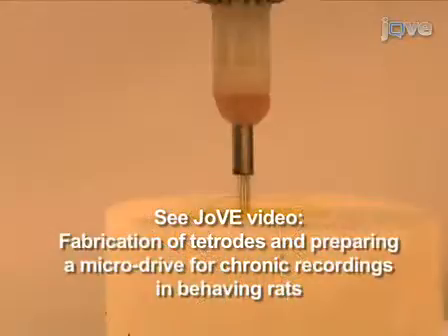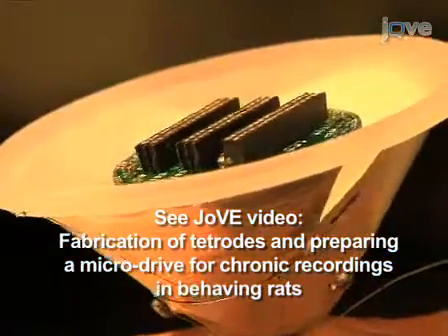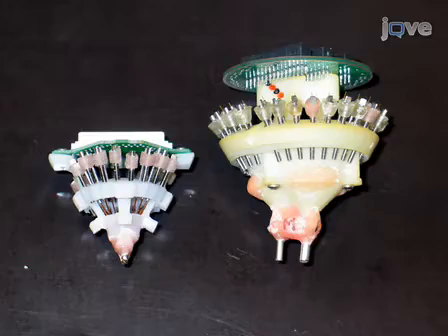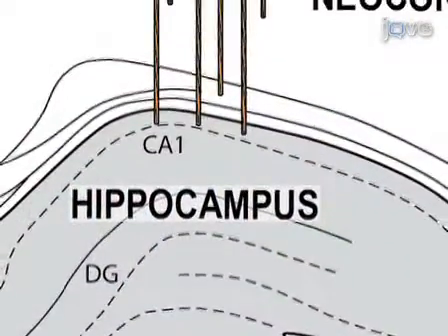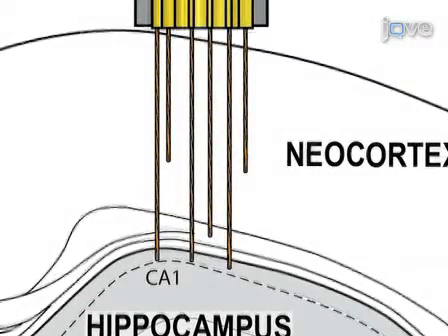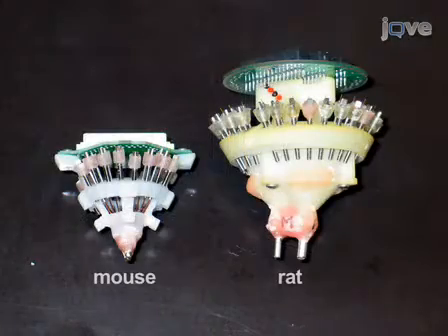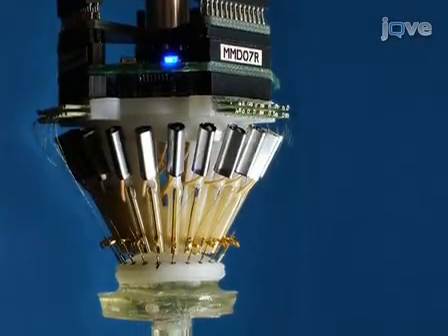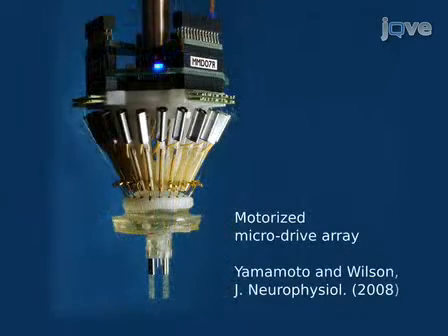This protocol can be followed directly or modified to meet your needs. For example, some researchers will require longer screws to record from deeper brain structures. Others may wish to design a drive that targets more than one brain location. The design can also be miniaturized for use in smaller animals like mice. With slightly more modification, motorized microdrives may be used which allow remote adjustment of the electrode positions.